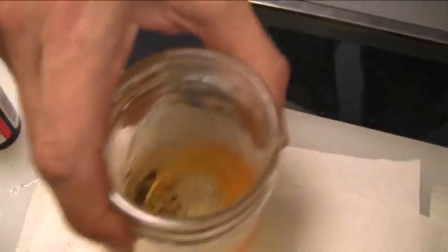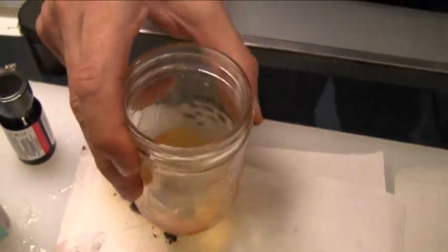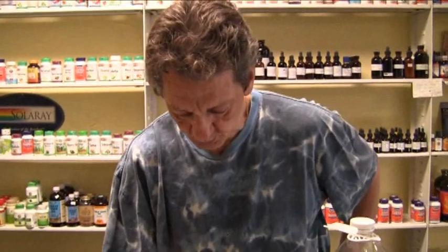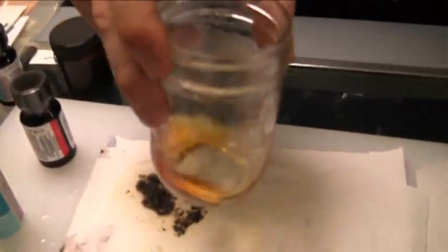Swirl it around and you'll see it start to dissolve. See how it dissolves? It's very, very water-soluble. Just a quick swirling and before you know it, it's almost done. Now we're going to add muriatic acid.